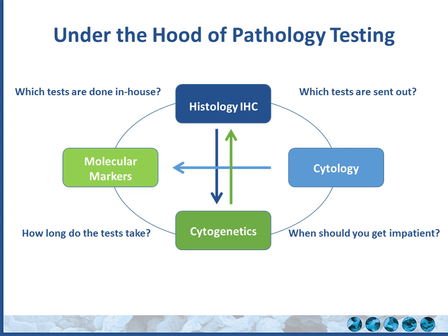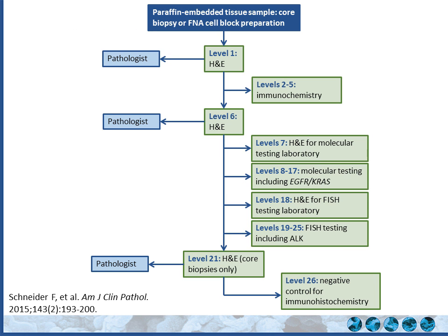Molecular testing, depending on your lab and what modalities you use, can take anywhere from 5 days to 2 weeks, 5 working days to 2 weeks. When we receive tissue or the cell block, it gets embedded into paraffin. And then to utilize that tissue, we have to cut sections from that paraffin tissue. Okay? Here are examples of where we cut the sections.